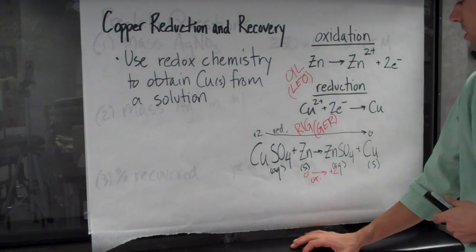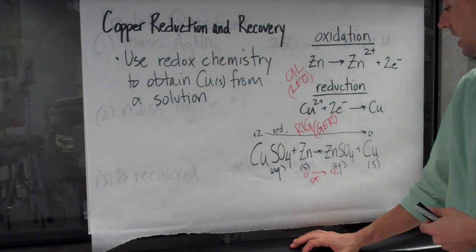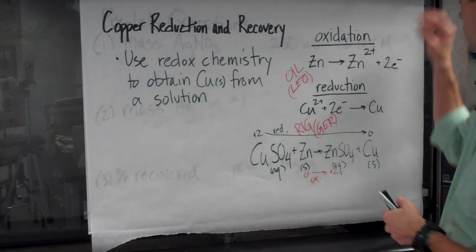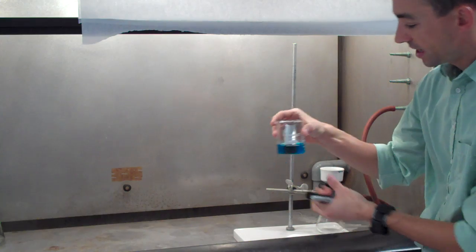And so let me show you some of the apparatus that you'll be using as part of the experiment today, and make sure that we're all set to safely conduct the exercise. So the main goal will be to get the copper out of the solution.